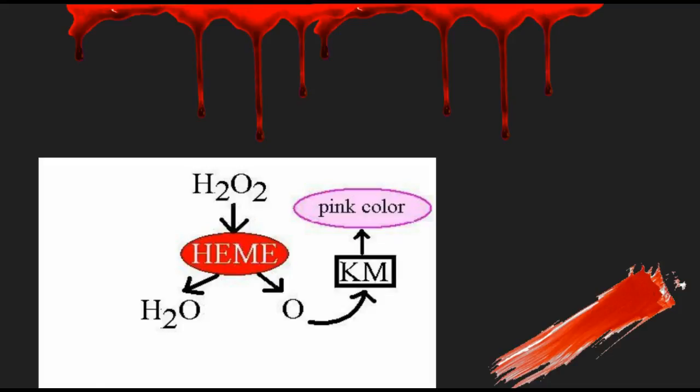A little bit of background here as to how it works. So here's a diagram here. I'll explain this. There's 2 things that aren't on here, the water and the ethanol. The purpose of the water on the Q-tip is just going to allow us to moisten the stain to pick a little bit of it up. We're not going to be successful in picking up part of our blood stain if it's dry and we run a dry Q-tip over it. So a drop of water gets added to the Q-tip to help us pick up a little bit of the blood.